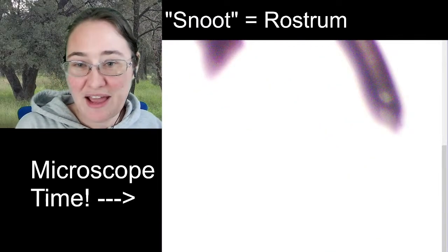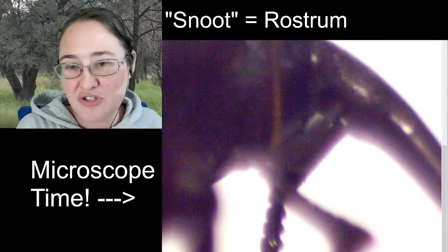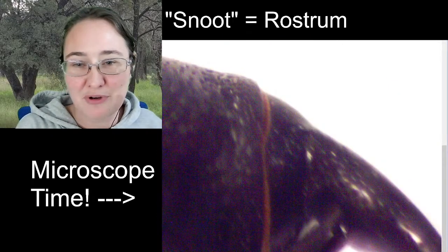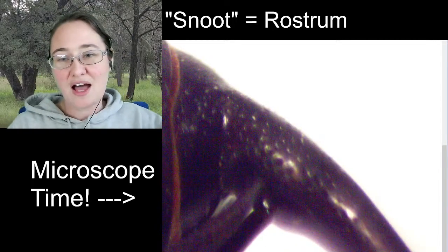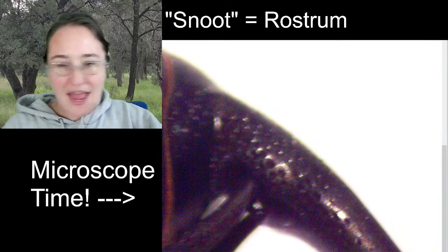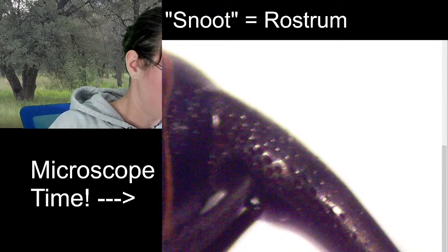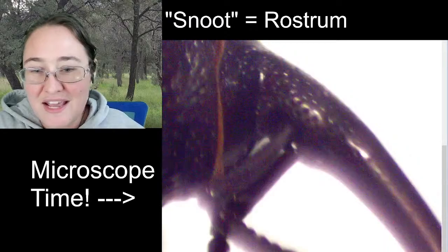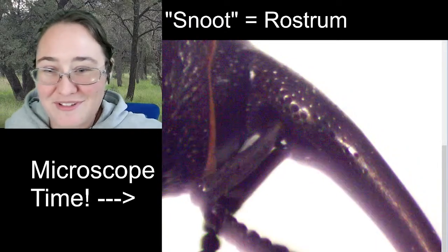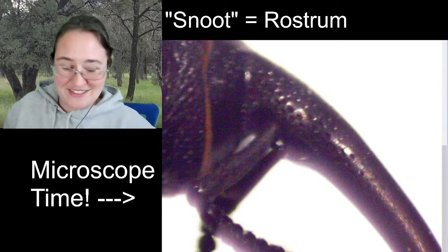It does have what we would call punctations, or like it almost looks like somebody put a pin in it over and over and over again. It's got these little holes. It's kind of nifty that as you go down the rostrum, it gets smoother and smoother. So the density of those punctations decreases the longer it goes down the snoot. So that's fun.